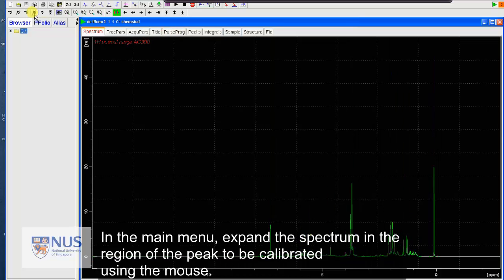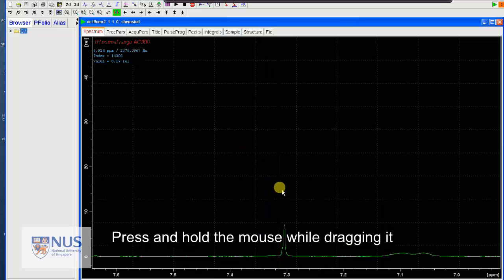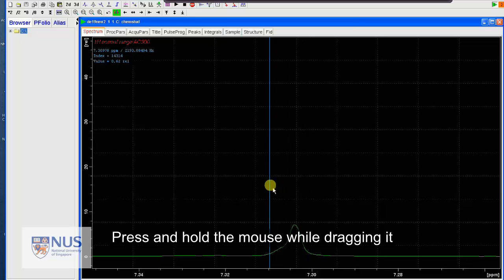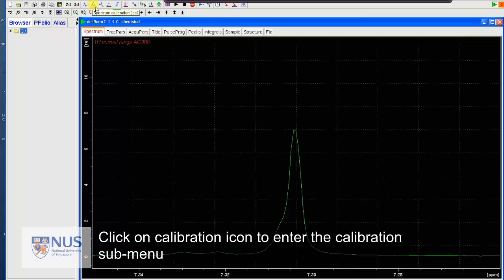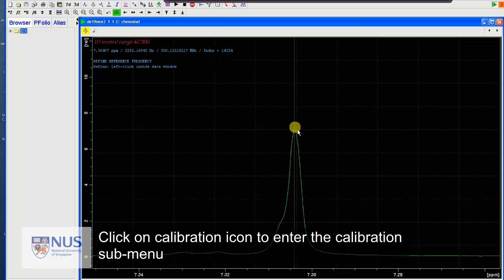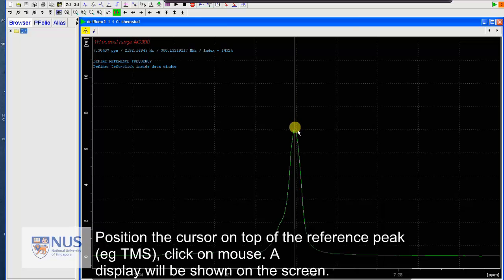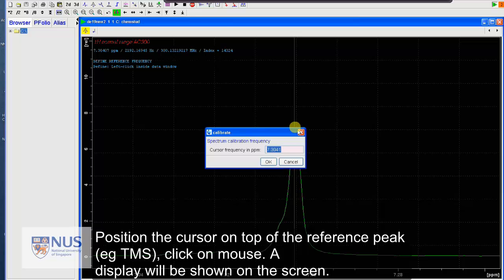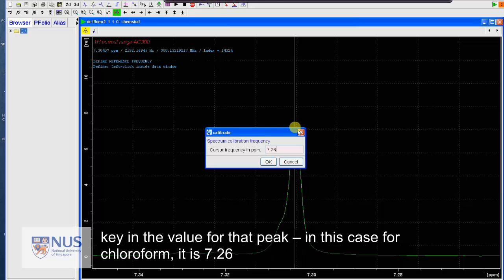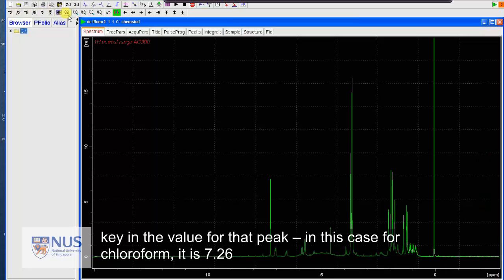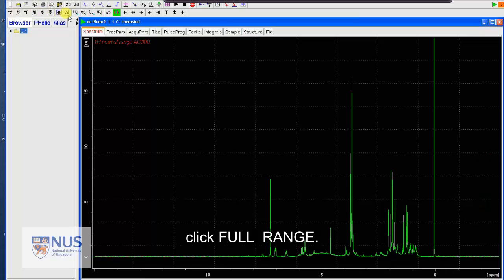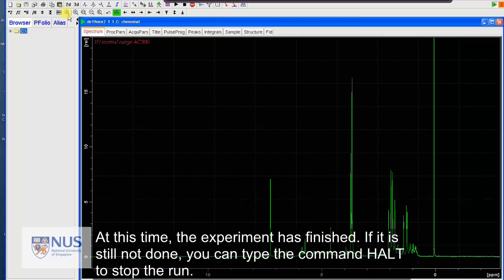In the main menu, expand the spectrum in the region of the peak to be calibrated using the mouse. Press and hold the mouse while dragging it. Click on the icon calibration to enter the calibration sub-menu. Now, position the cursor on top of the reference peak. Click on the peak. Click the mouse. A display will be shown on the screen. Now, key in the value for the peak. In this case, the solvent we are using is chloroform, so the value is 7.26. Click full range.